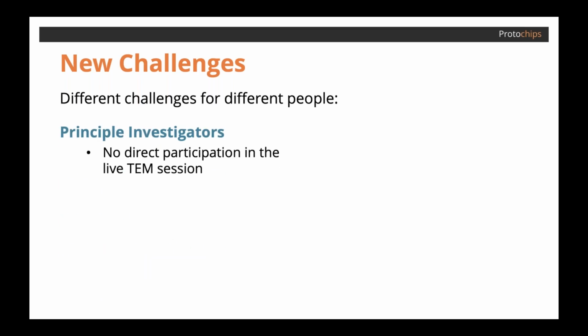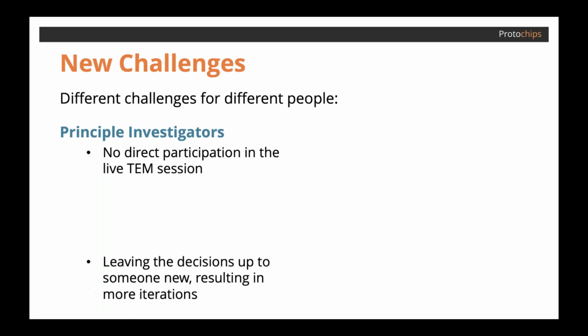One perspective being from the principal investigator side, or the researcher standpoint, and they no longer have direct participation in the live session. Watching it occur on a tripod camera over YouTube is nowhere close to being physically present. So many details are lost with image quality, and there are lots of questions that come up and lots of back and forth, and it causes distraction, and no one's really focusing on the experiment anymore.